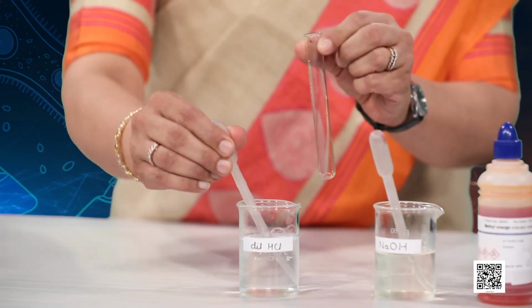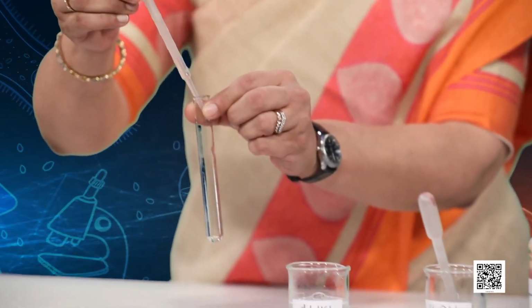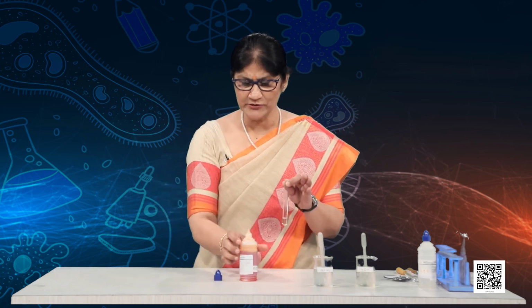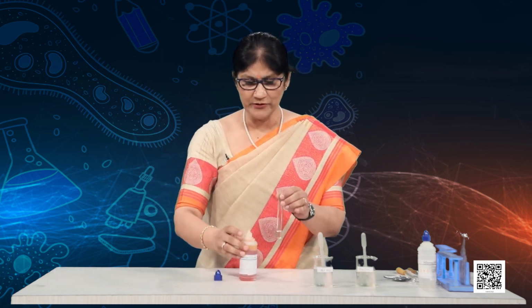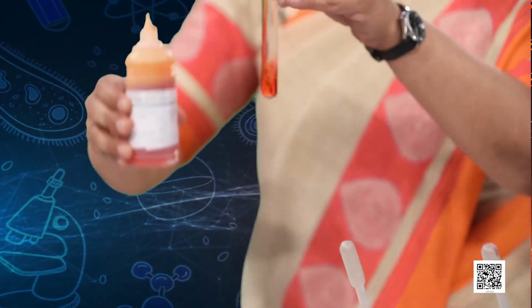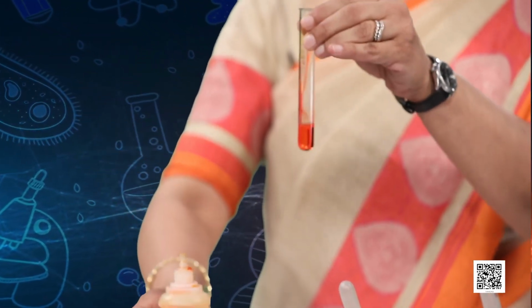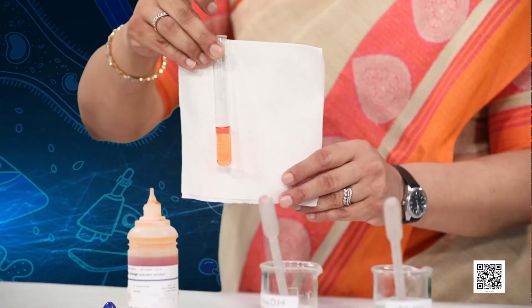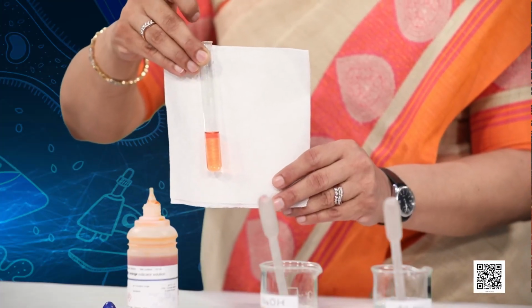So let me take some dilute HCl, and now you remember the color change that dilute HCl gives with methyl orange. So this is methyl orange. Let me put one drop of methyl orange, and do we have a color change? We will see this against a white background. Can you see the color change? So from orange to pinkish red.